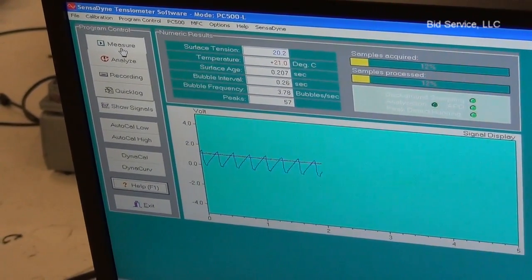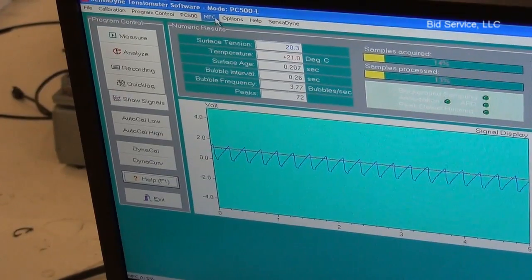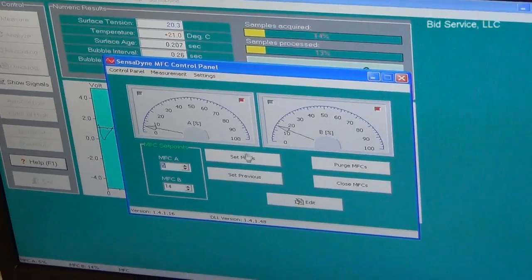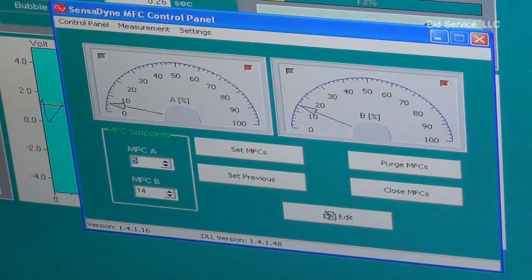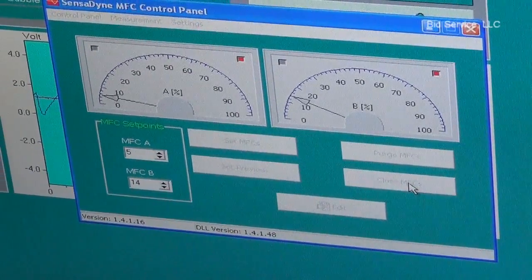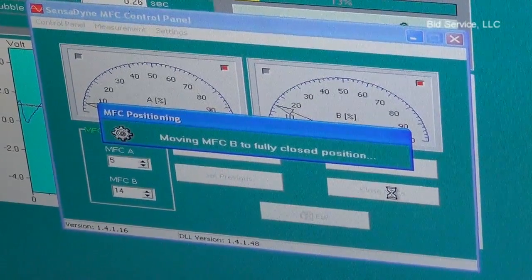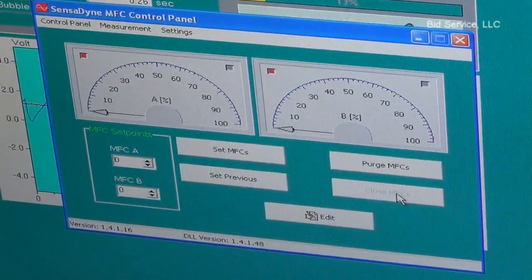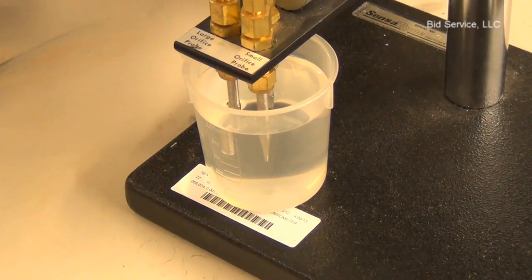And here's your MFC controller panel. Here you can change your flow rates, which will change your bubble frequency. I can close them both so now they're both at zero — you see no bubbles coming out. And you can also open them, which will bring them both to 100%.